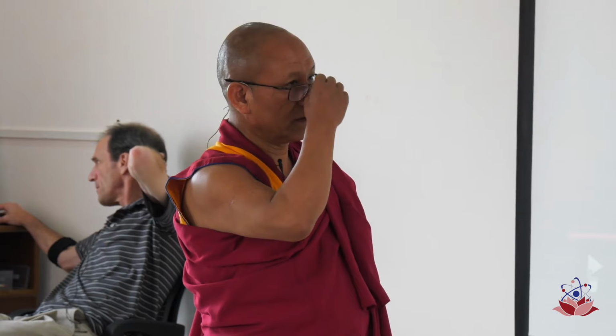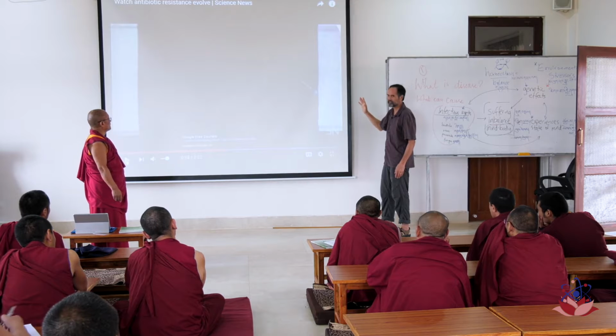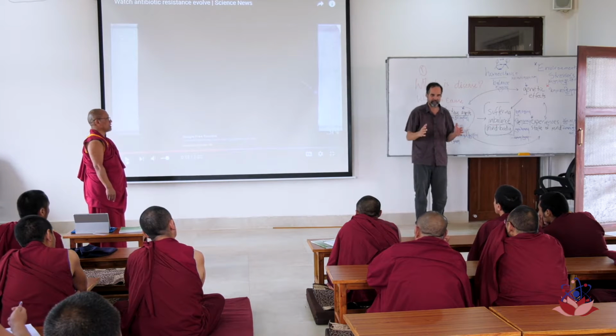So let's run the movie. Watch what happens. So now it's growing in the zero zone. Zero. You see they spread in the area where there's no antibiotic. Up and stop it. And then immune. Okay. So, right? No antibiotic.